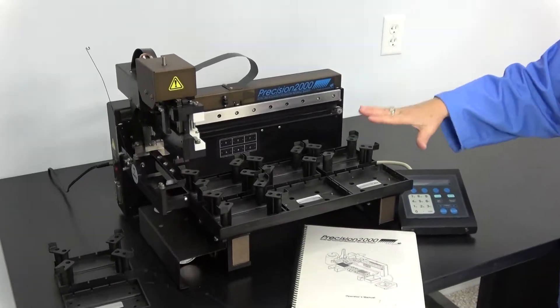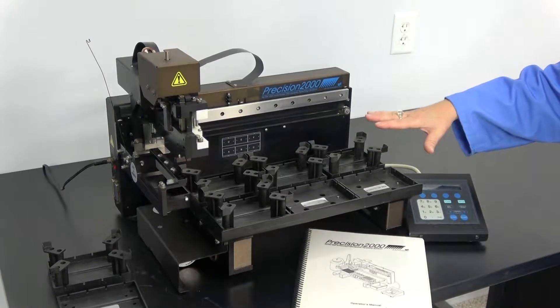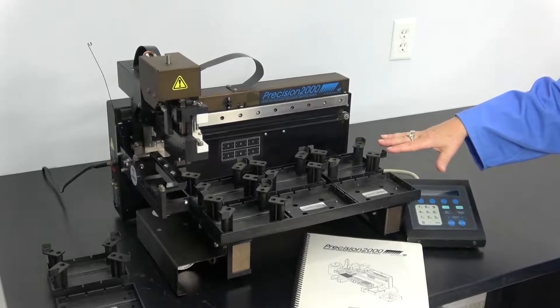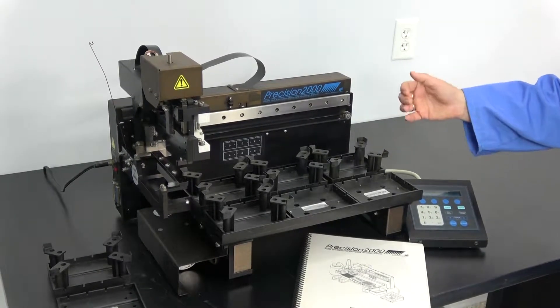This is a great instrument for those tests like ELISA, cell-based assays, secondary screening assays, or really any kind of testing that involves a large amount of hand pipetting.